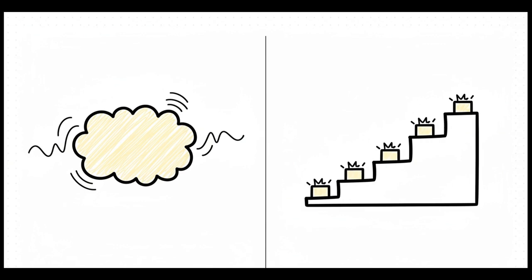The classical theory is super helpful for picturing a squishy electron cloud acting like an antenna, but it doesn't quite give us the complete modern picture. See, classical theory focuses on continuous waves and changing polarizability. To fully solve our mystery, we really need to juxtapose this with quantum theory. Quantum theory focuses on discrete, quantized energy states, highly unstable virtual states, and the exact packet-like transfer of photon energy. It's a real game changer.